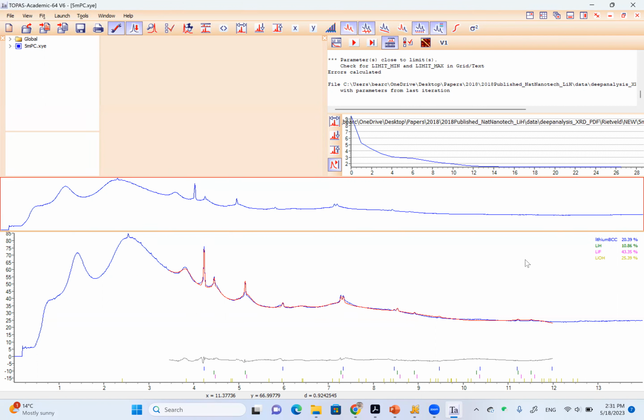So you can check the lattice parameter we got in our previous refinement and use that for the lithium metal peak. This is a sort of refinement strategy, because if you don't fix the lithium metal peak in the very beginning, the program may very likely lose focus, because there are several variable things at the same time. You may have a hard time trying to identify the position of this metal peak.